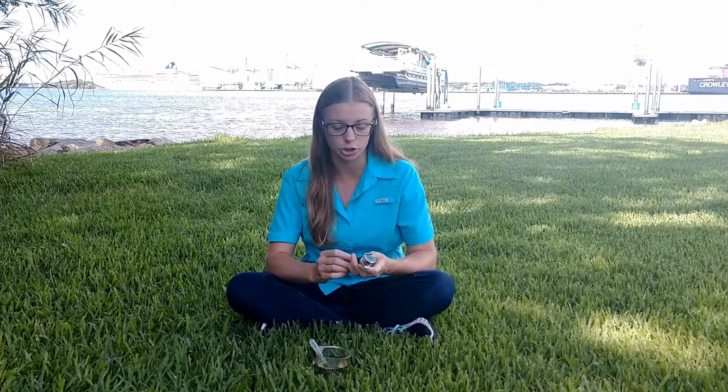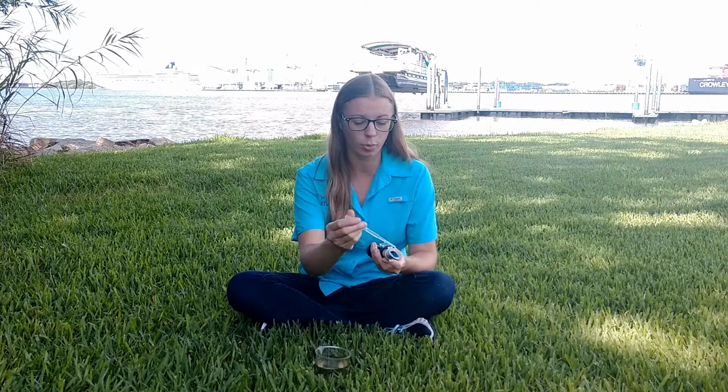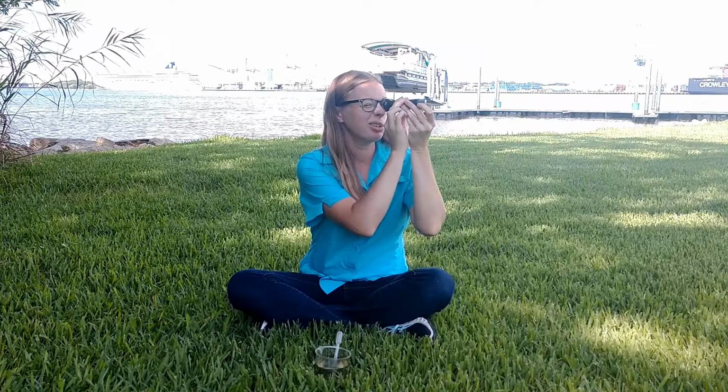Let's test the salinity of our St. Johns River today, June 12th, 2020. We already collected our water sample earlier, and the scientific tool we're going to use to measure the salinity is called a salinity refractometer. So it uses refraction. And how it just works is I'm just going to put a small sample of our water on the blue platform, close the lid, and look through it.